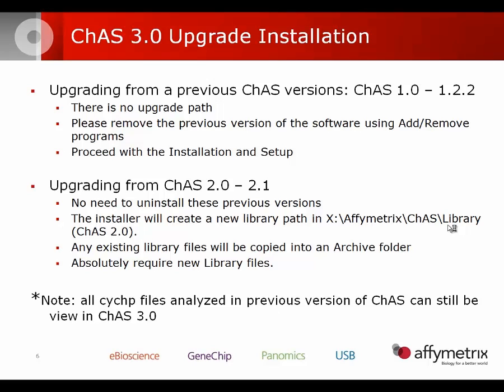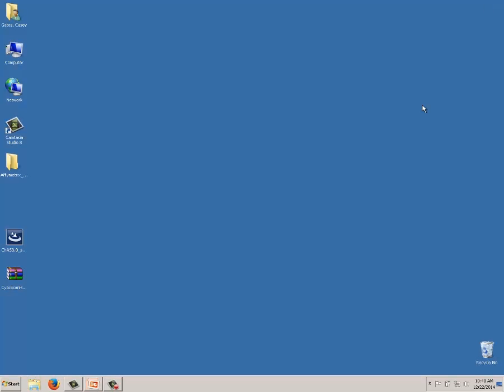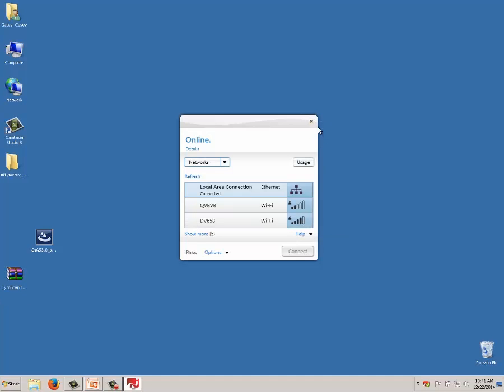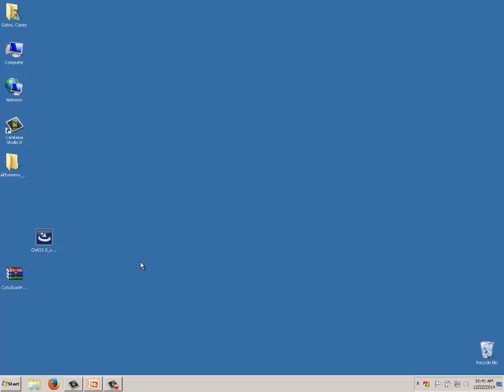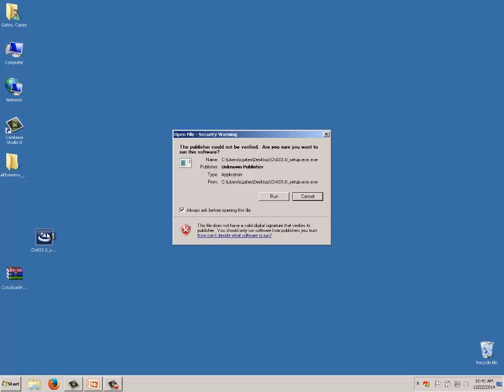Now we're going to proceed to the software installation walkthrough. On the Affymetrix.com website, go to the Chromosome Analysis Suite page and download the software. You'll get a zipped package with the installer — the CHAS 3.0 setup.exe. Also available on that page are the analysis files for each array type. You can download library files to copy directly into the library folder, or download them through the software once it's installed. I'm going to double-click on the setup executable.